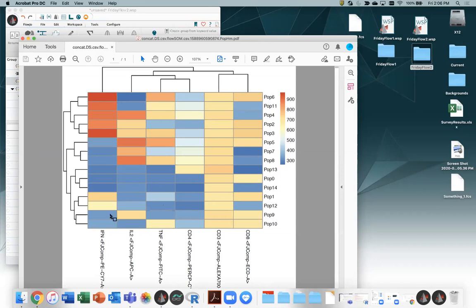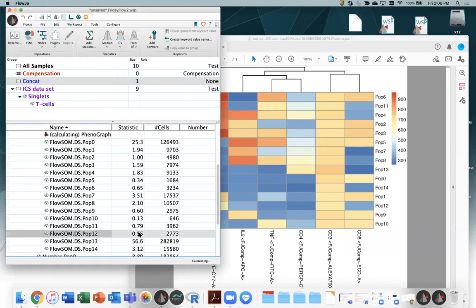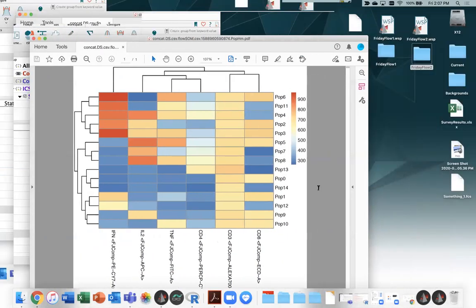And if we glance at the next two up, we also saw that these are 3s and 8s. And what they are is the interferon gamma positives. However, one of them is probably negative for 8, but it's one of our double negative populations. So we're a little suspicious about population 12, which also was a fairly small population, 0.55%. So we're wondering about 12 biologically, and perhaps as it's a double negative, I'm not sure how it fits into the T cell landscape, being naive.